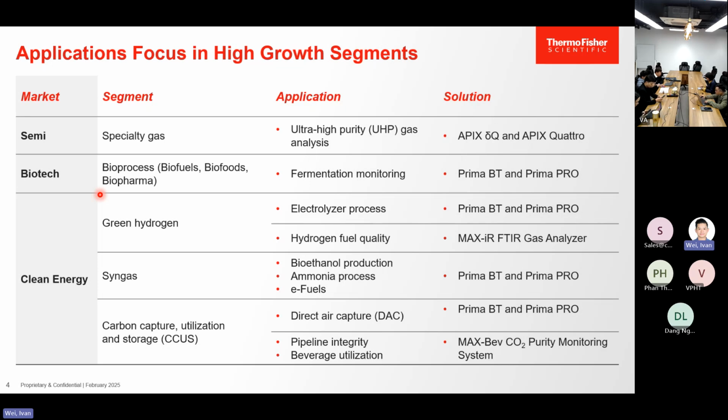And then we measure their outgas, or maybe some gases they need to feed the algae, feed the bacteria. So here, the application is called fermentation monitoring.